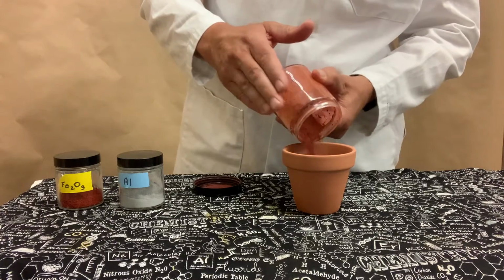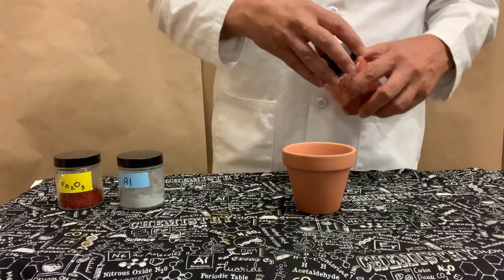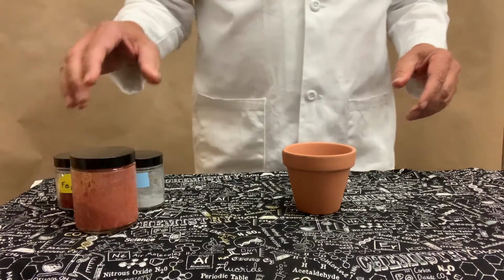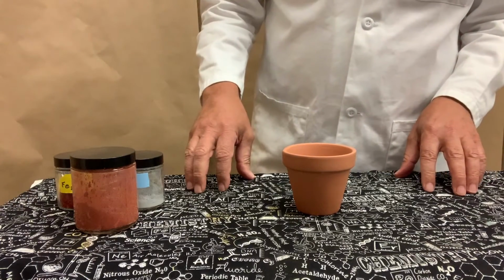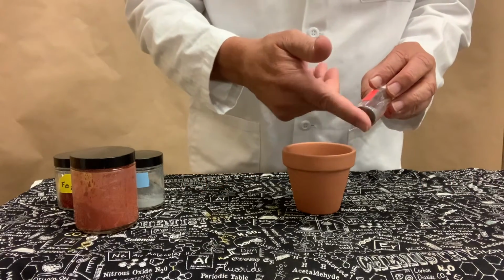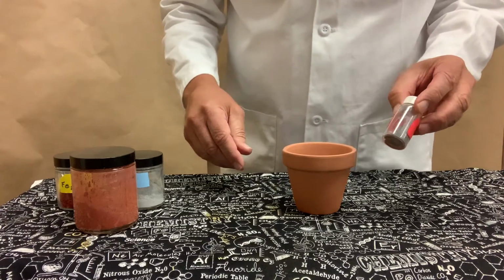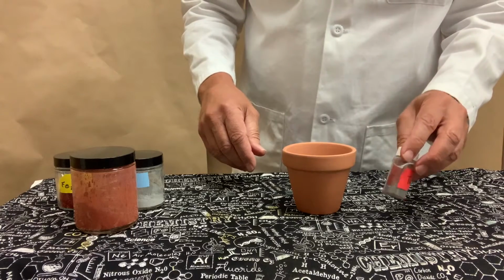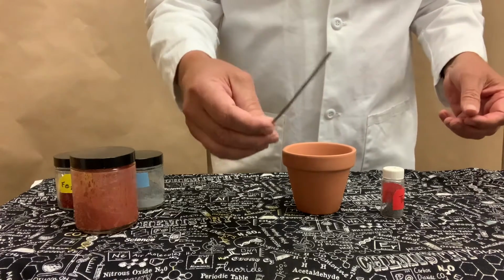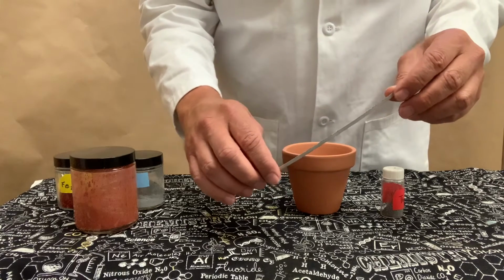Now, one of the characteristics of the thermite reaction is that even though it releases a great deal of heat, you have to get it to a very high temperature to get it started. In order to do so, I'm going to use this gray powder called thermite starter. It's a mixture of barium peroxide and finely powdered aluminum. And then, as a wick or fuse to get it started, I'm going to be using this magnesium ribbon.